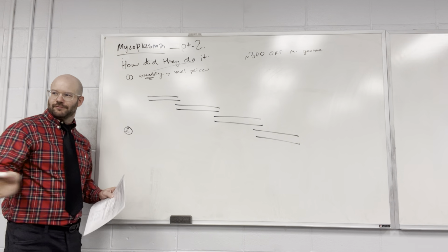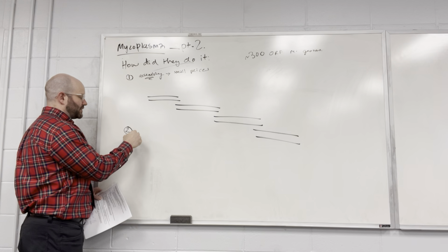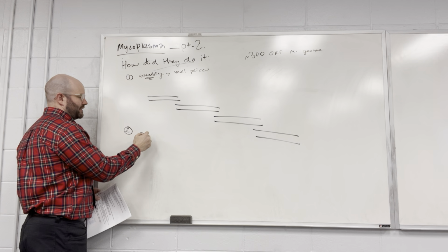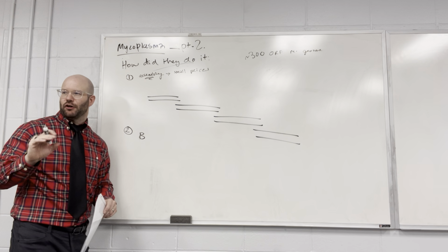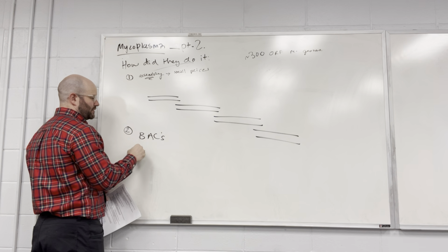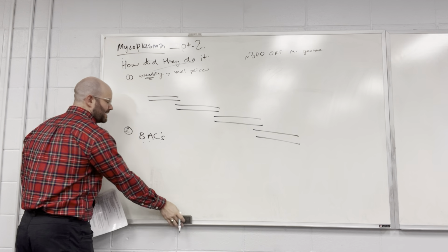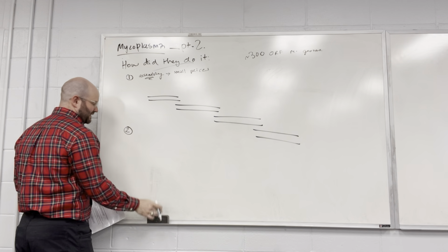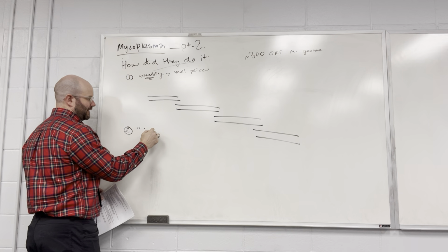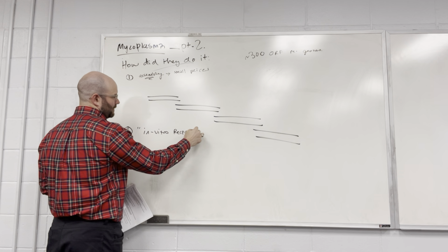They put them together using bacterial artificial chromosomes. Okay, so that's not how, but that's the holder. So they're using BACs, yes, bacterial artificial chromosomes. Is it the in vitro recombination? Yeah, so this is interesting. Okay, so they have this word called in vitro recombination.